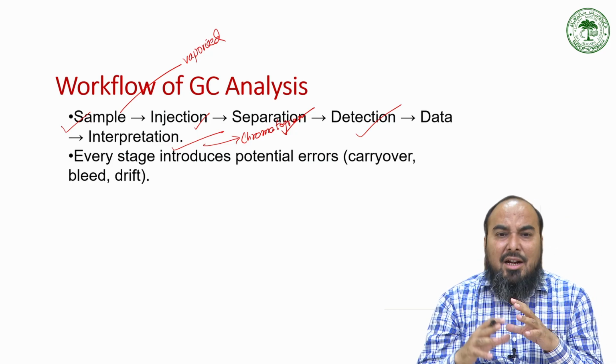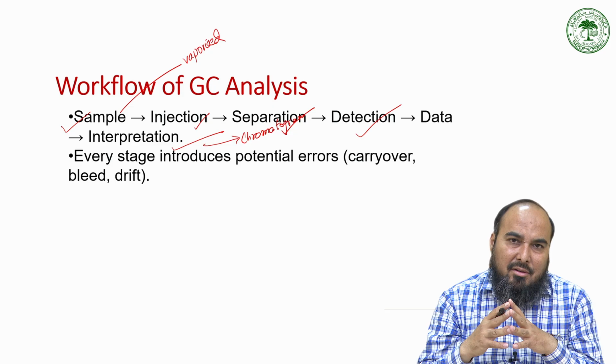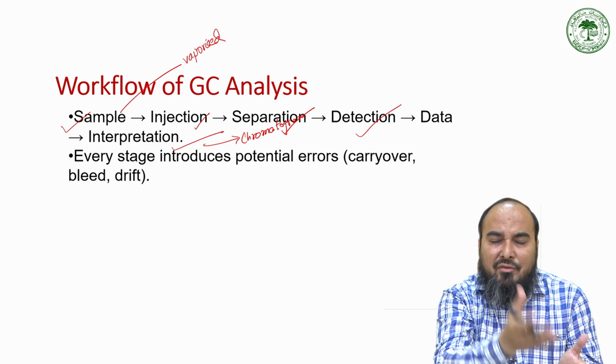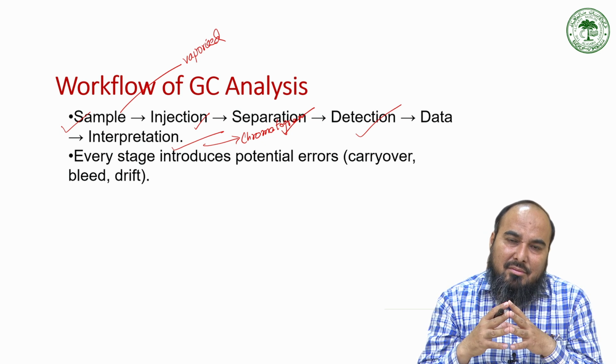At every stage, there are chances of errors. There may be chances that you cannot vaporize your sample perfectly, and if you are unable to vaporize your sample perfectly, then there are chances of error. Or you have chosen the wrong injection port.